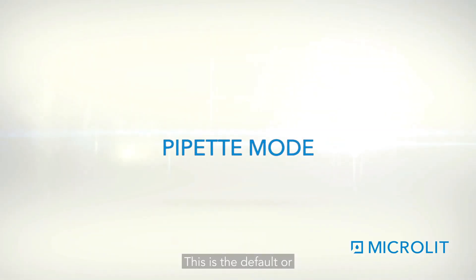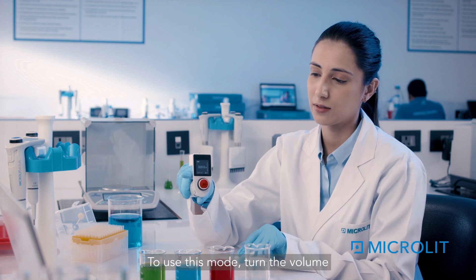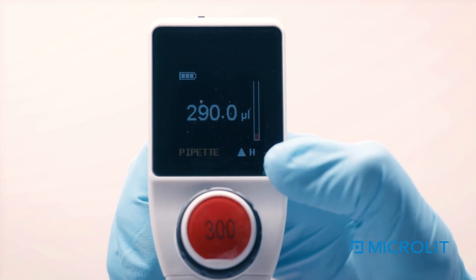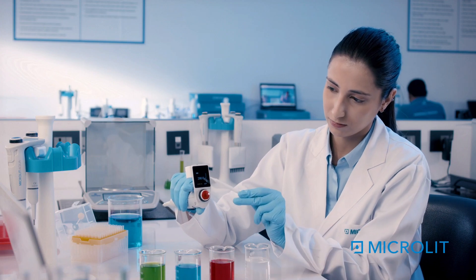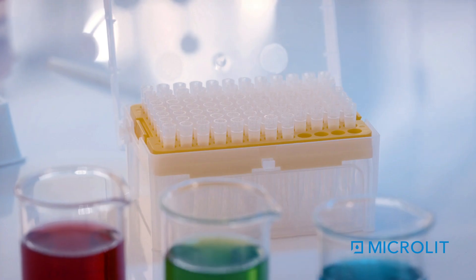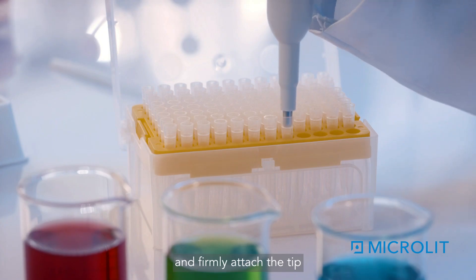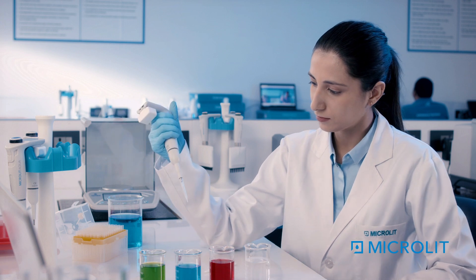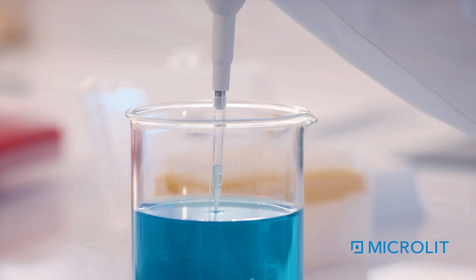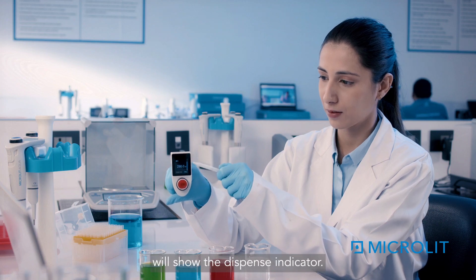Pipette Mode is the default or automatic mode when the pipette is on. To use this mode, turn the volume adjustment wheel to set the volume — the aspirate indicator will be displayed. Secure the tip by connecting it from the tip box: move the pipette closer to the tip box and firmly attach the tip using gentle force.